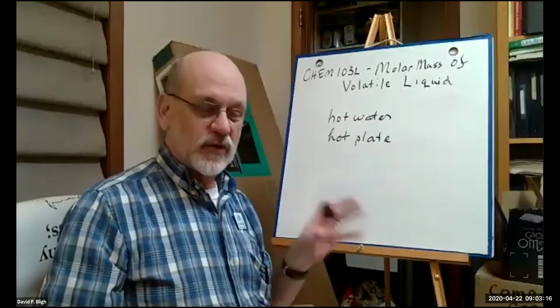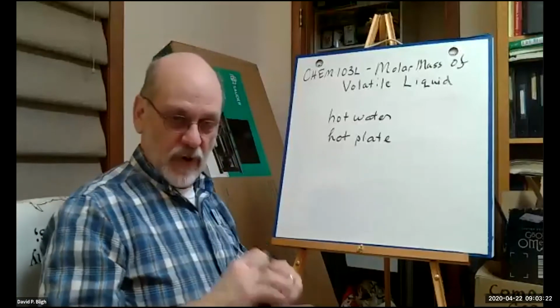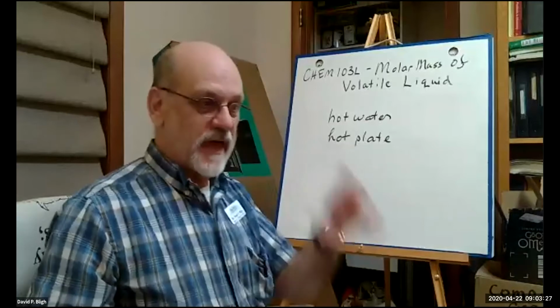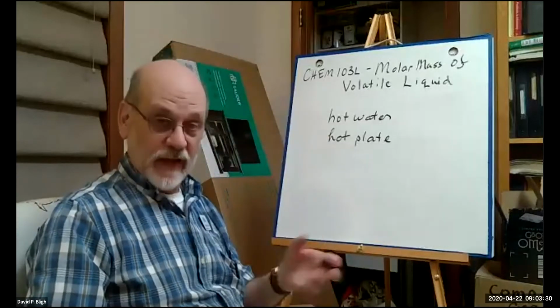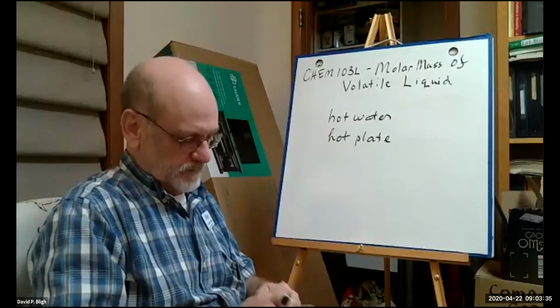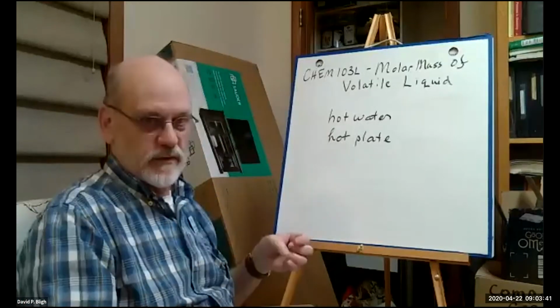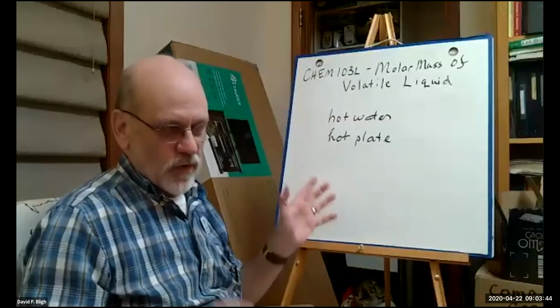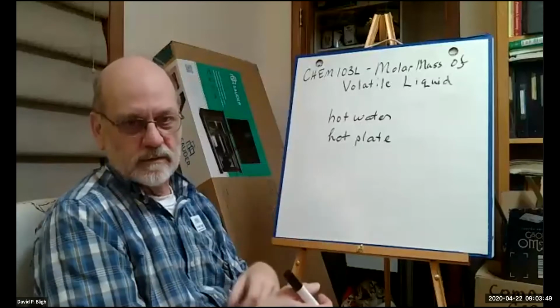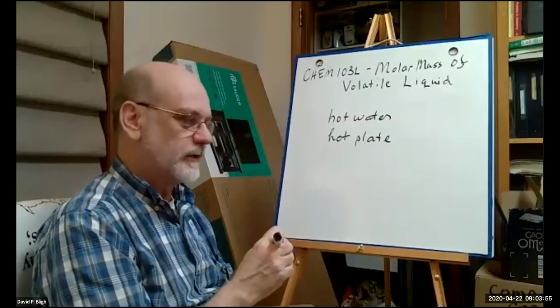You've got a volatile gas, and these gases are organic compounds. Most of them are not going to be hazardous. But if you sit there and sniff it as it comes out of the top of your flask long enough, they say you could kill some brain cells with it. If that's true, then I've killed a lot of brain cells over the years because there's just no avoiding smelling some of these things. But there's a potential hazard there, particularly if you have a pre-existing lung condition. It wouldn't be good.